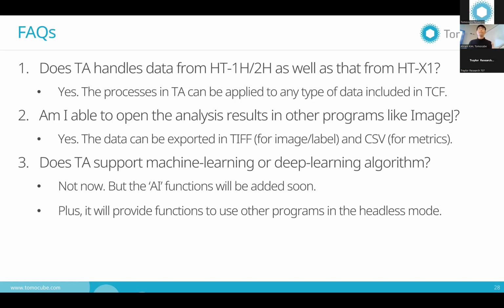In a nutshell, it's like Z stacking, but for every Z position, we take multiple images with different light profiles. By using different profiles, we can simulate the angle of the light illumination. In principle, in tomographic holography, the light incidence angle changes through 360 degrees, so it rotates.